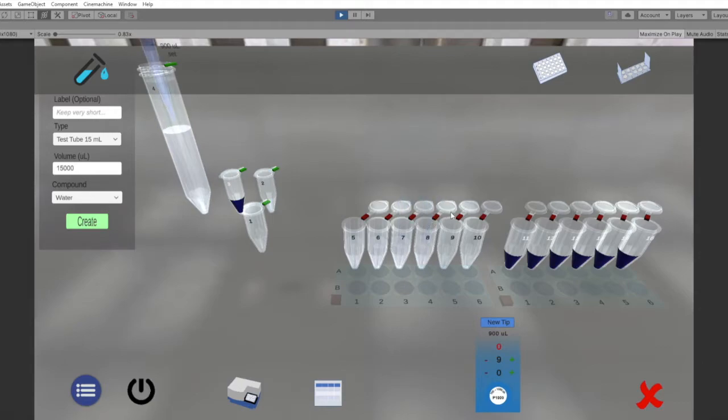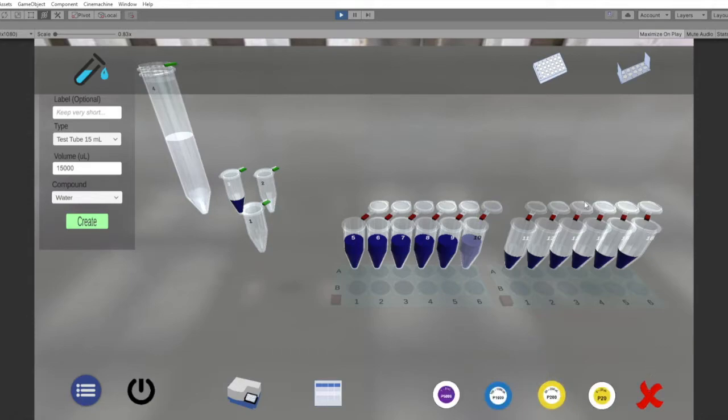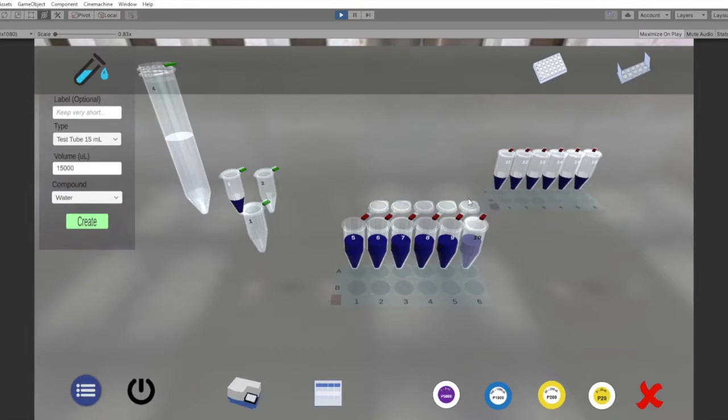And then I'm going to put 100 microliters of the blue unknown solutions into there. So let's get rid of that pipette tip, get a P200 up, get a new tip, and now let's just whiz through this and put each of the blue solutions into their corresponding dilution. Now, these pipetting actions do have some error with them, and it's quite clever what error that is. There's carryover, there's residual volumes. All of those are dependent on the type of pipette that we're using.